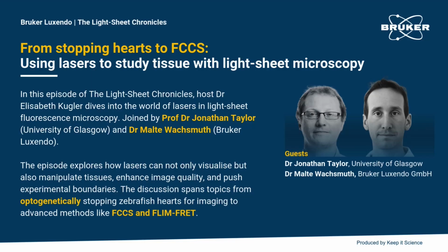Today, we will talk about the things we can do with lasers, including how to use a light sheet to improve image quality, adopt application-specific beams, and use lasers to manipulate tissues.